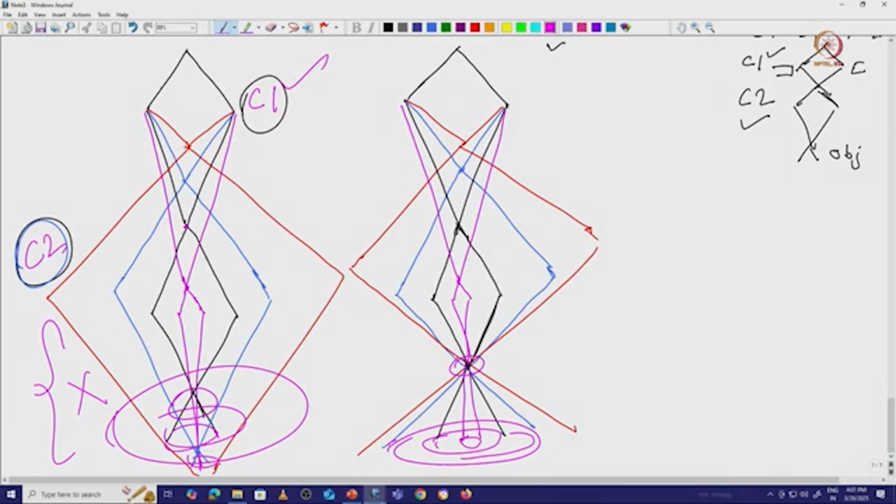This diagram shows that if we are only changing the C1 and C2, it is just the fixed one. So what kind of beam diameter can we get? But here you can see there is a systematic way it is going: if we have a particular spot, in this particular case your spot size is very small.